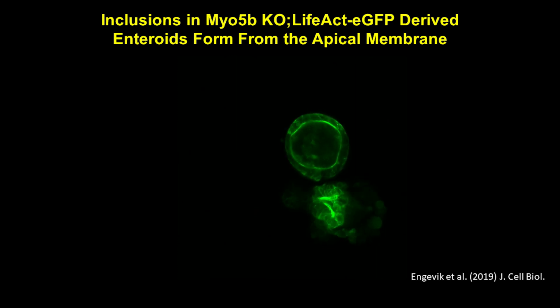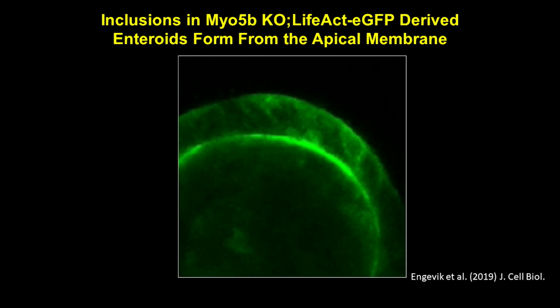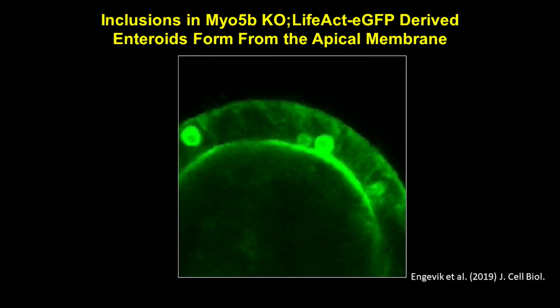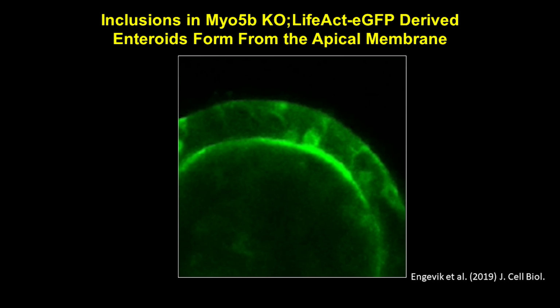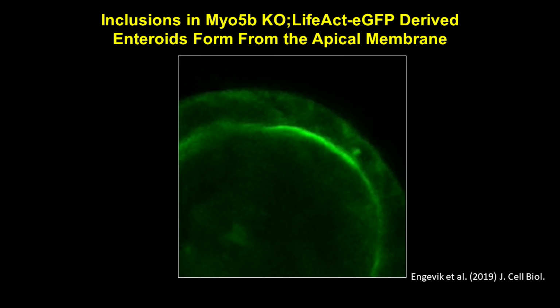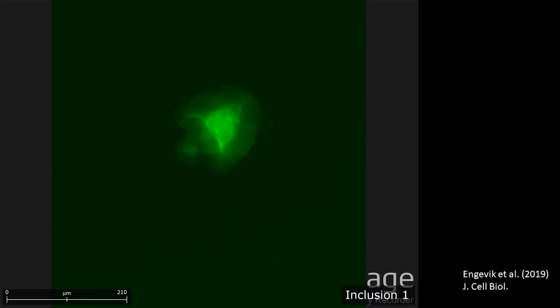And the organoids have allowed us to visualize this a little better. If you just focus here, you'll see these inclusions forming, and you'll see right about here an inclusion is going to form from a little omega and then punch in. This actually takes about 2.5 hours to happen. This is an extremely slow process, and it's so slow I added an extra movie bonus. Here, you'll see this one come off. Maybe we'll do that one more time so people can follow the arrow. I hope you got that.